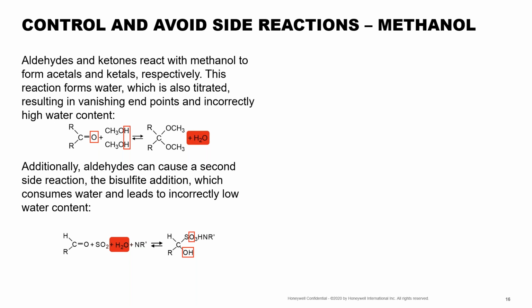And again, here we've got the aldehyde second reaction taking place on the bottom of the slide here that's using water. But any reaction that's taking place in our reagent system that is either forming or using water, then at the end of the day, that is going to be measured by our instrument, and that's not water that was originally present in the system. It's water that got formed from our sample reacting with the working media itself.